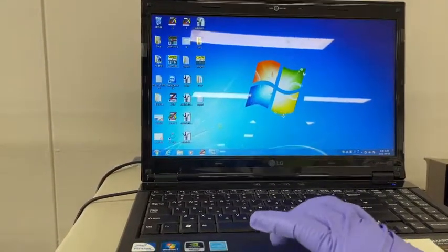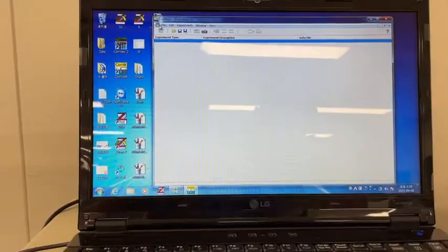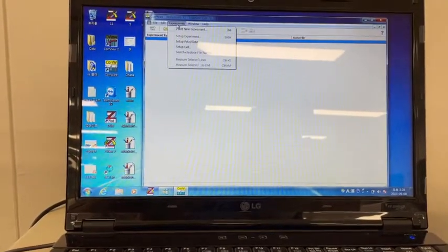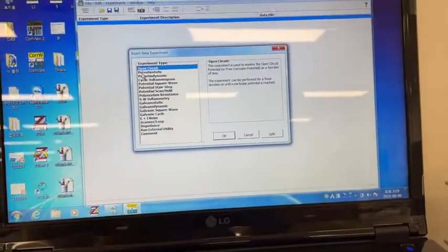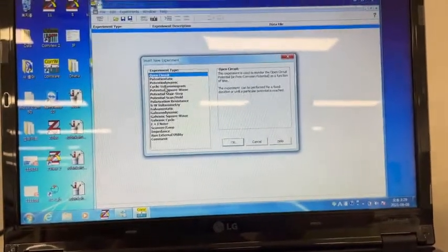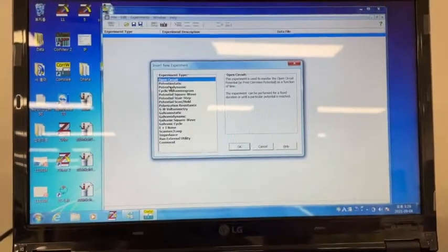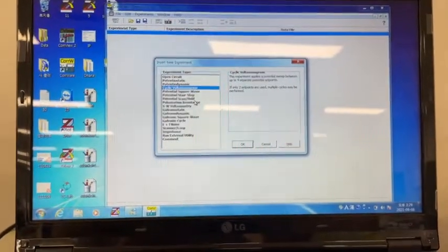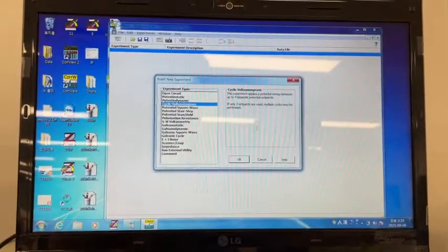Survey, part, okay, yeah, experiment. First in the experiment, and then insert new setup, and then you need to do it with this, which feature you want to have. Cyclic voltammetry you want, or any kind of study you can do with this, depending upon so many parameters. Okay. I will be doing the CV voltagram, cyclic voltammetry.